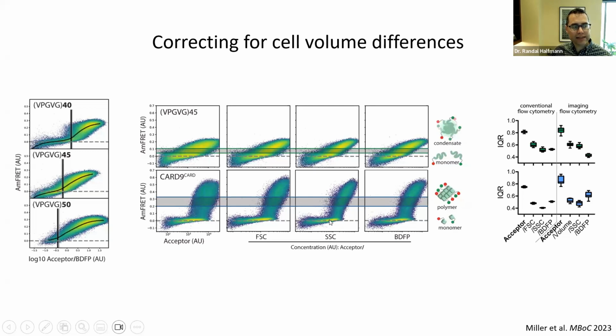So now, especially focusing here on side scatter, we can collapse this relatively broad transition to a much tighter transition. You can see this really nice kink in this flow plot, and that kink precisely tells you where the phase boundary is, or the solubility limit of that polymer is. Right? And so you can, in principle, convert this to actual units of concentration, like micromolar. That's a little more complicated, and we can tell you more about that. Or what we typically do is just do it comparatively.